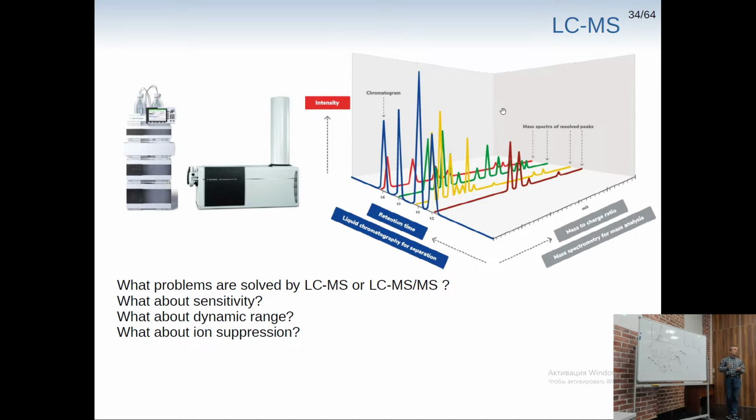So that's what is called data-dependent acquisition. We have a set of rules, and during the acquisition, during the chromatography run, we decide based on these rules which peak gets to be fragmented. For instance, those two are not peptides, we will not be interested in them, we will not fragment them. There will possibly be something that will elute at every time, some contamination in our water, for instance, and so on and so forth.